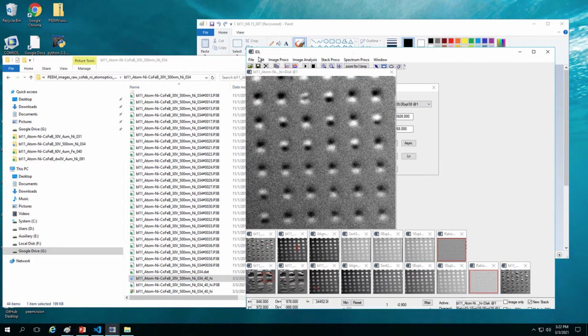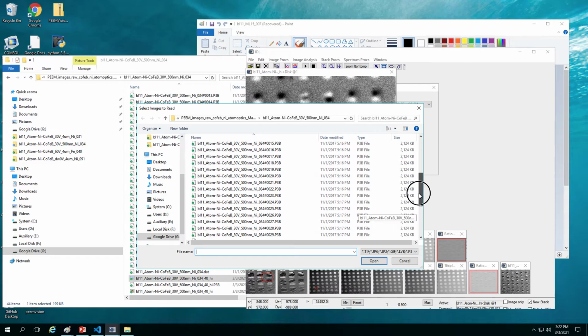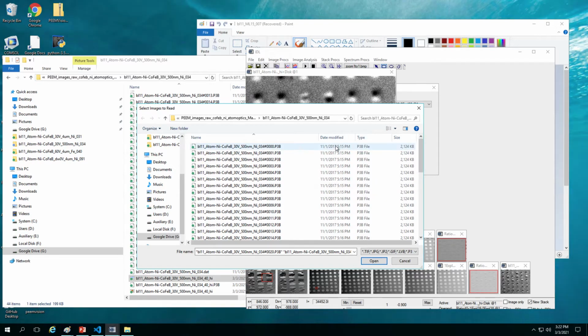And to generate the low resolution one, we mentioned we want to keep the proportion right. So 20 versus 4, 5 versus 1, so 40 versus 8. Then we load, we'll pick four images from like the last 20 of them, and then 4 from the first 20 of them. Control, make sure, control, now 8 images in reverse order.